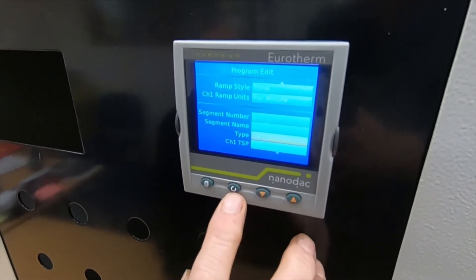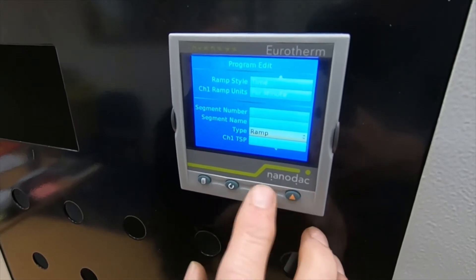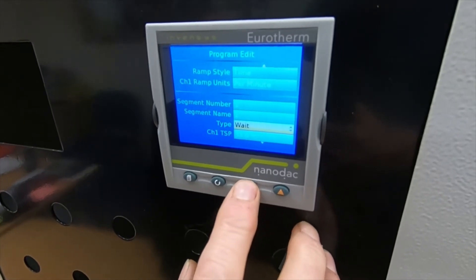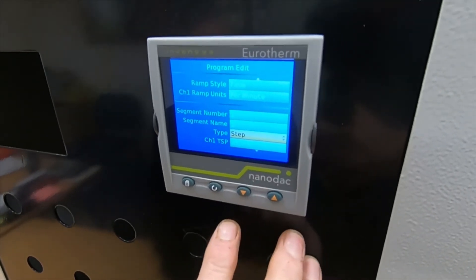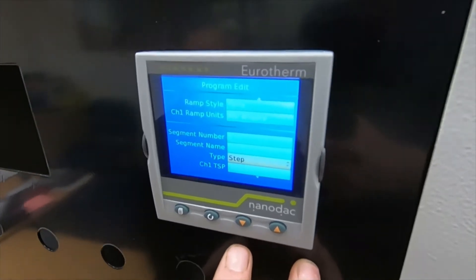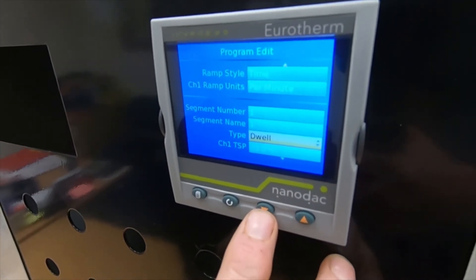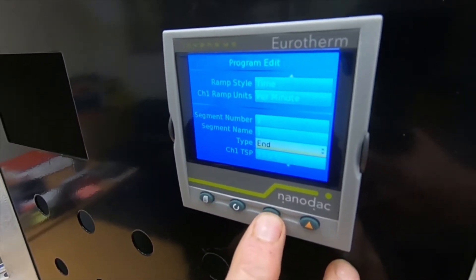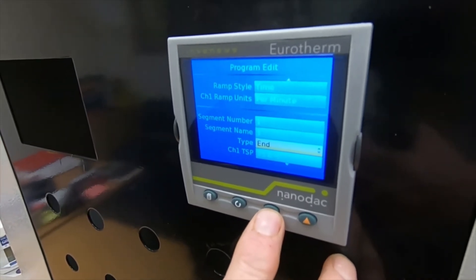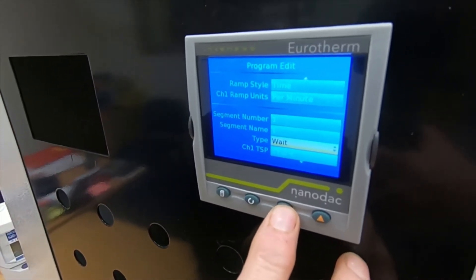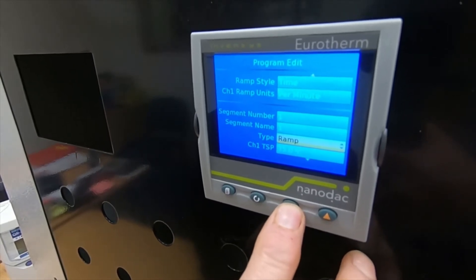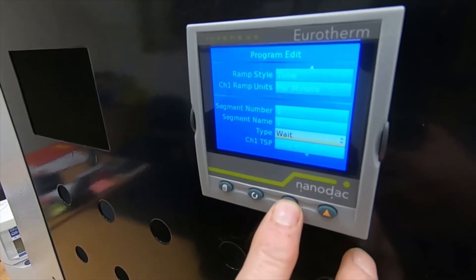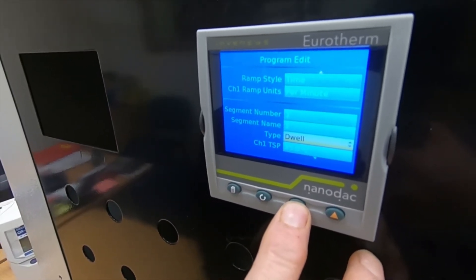The choices are: ramp — where it's either going up or down, changing temperature; step — where there's no time, it just jumps; dwell — meaning it will hold at a constant temperature for whatever length of time you set; and end — which ends the program. Wait we never use.